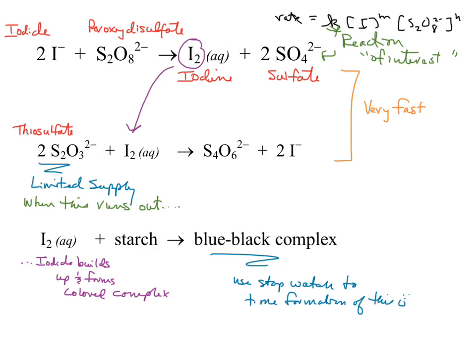Okay. So for instance, in this one, this is 1A. This would get 8.0 milliliters of I minus, and it would also get 4 milliliters of your thiosulfate. Okay. This one would get 8 mils of your peroxydisulfate solution. See how that works? If you add 8 plus 4 plus 8, you get 20. In each of these, when we pair them up and dump them together, your solution's going to have 20 mils there. Okay. So this is one where you want to have a clear mind. Go ahead and make sure you get your solutions. Make sure you get it right.